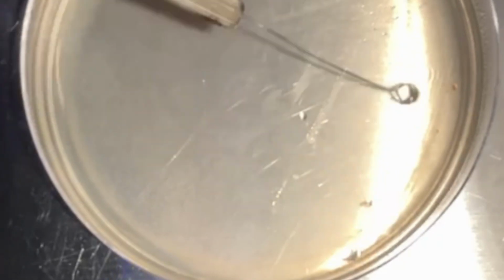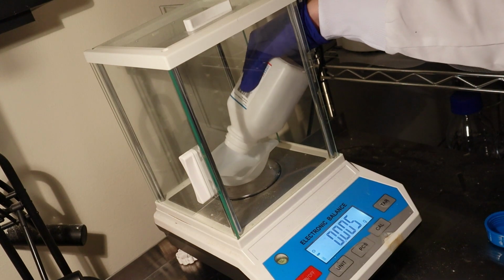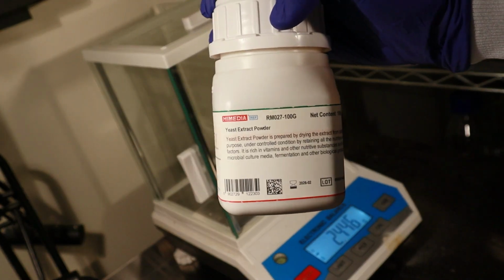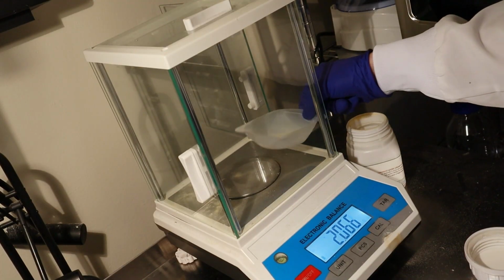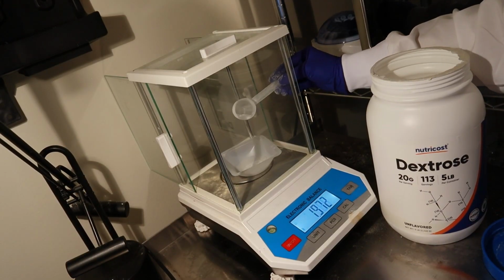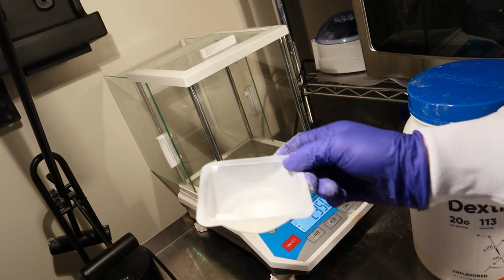Anyway, in order to start the project, I would first need to spread the Streptomyces bacteria I bought over a gelatin-like substance called Streptomyces agar. To make the agar, I weighed out 6 grams of agar-agar to form the gel, 2 grams of yeast extract as minimal nutrients that favor most bacterial growth, and 2 grams of dextrose to favor Streptomyces growth as they prefer dextrose.